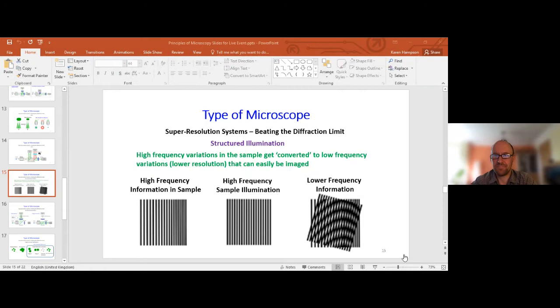Okay, that's perfect. So does that mean that the entire process is computationally extensive, and so you need more computational power? Yes, the computation is essential for the reconstruction of those images. And if you are doing three-dimensional versions of this structured illumination imaging, you need a minimum of 15 images in order to reconstruct one frame. And those 15 images will be taken with different structured illumination patterns on them.